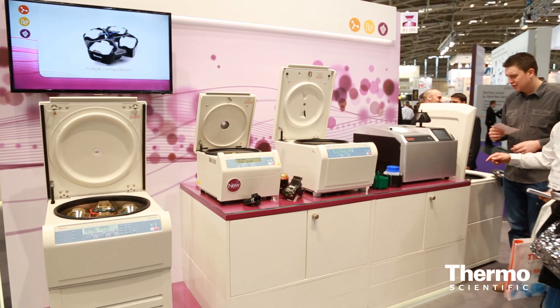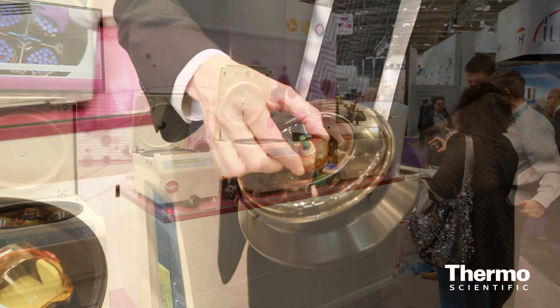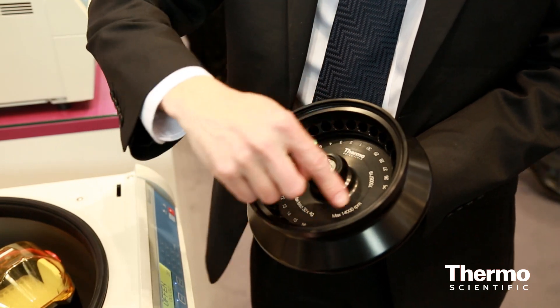The new product that we've got is the MicroClick 30, and this is our first product that goes across a range of centrifuges — not only our general purpose centrifuges, but now also our small bench centrifuges.